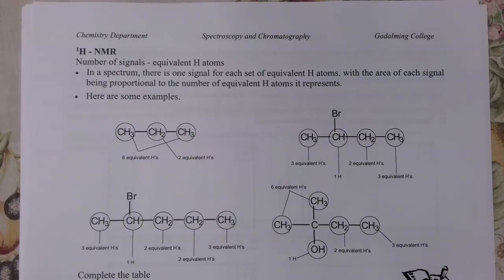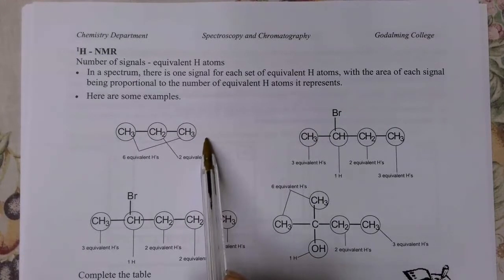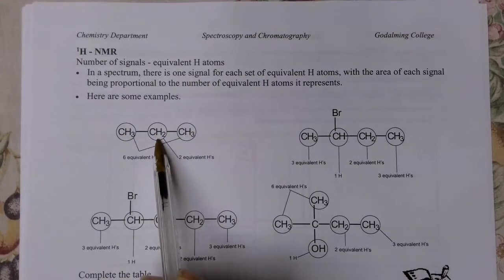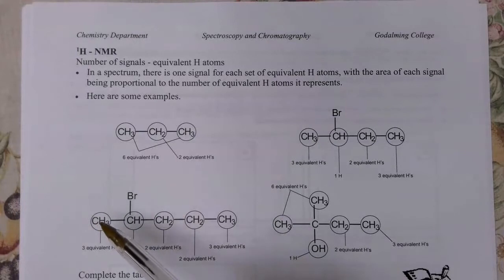Okay, so we're going to be looking at page 7 of your notes, and we're looking just at some molecules. Now the first thing we're going to look at is the number of different hydrogen environments. This is exactly the same as the carbons. So here, for example, we have two hydrogen environments. These two hydrogen environments on the end, the CH3 groups, are identical to each other, and then we have this CH2 group in the middle, which is a different hydrogen environment.